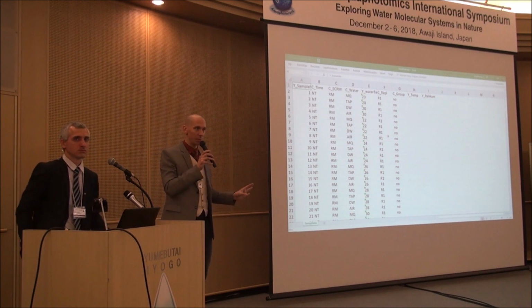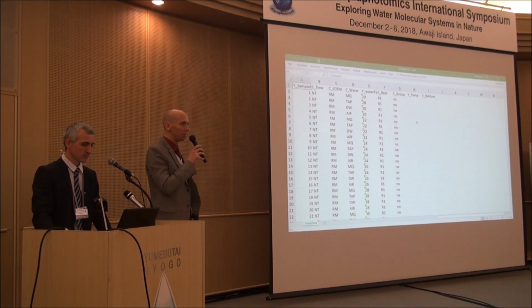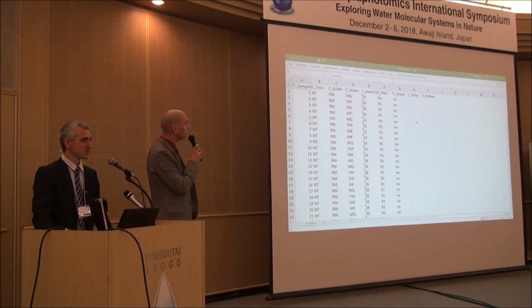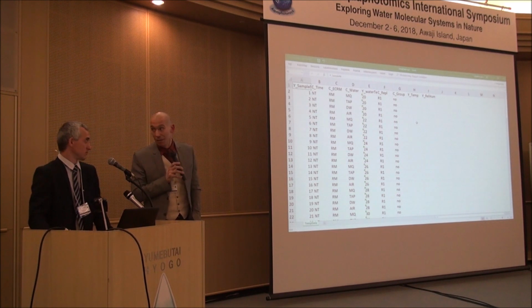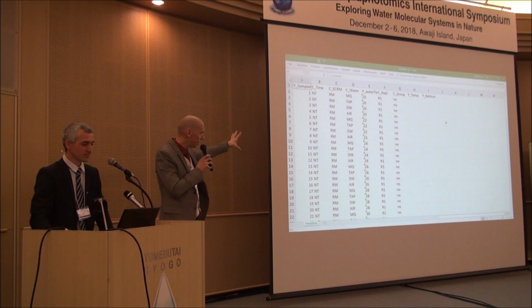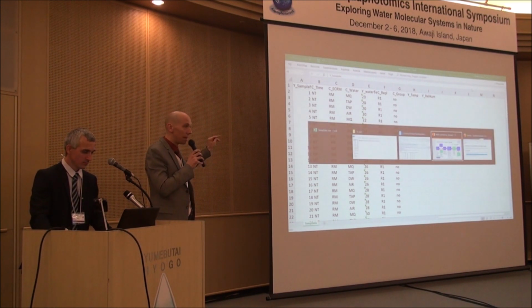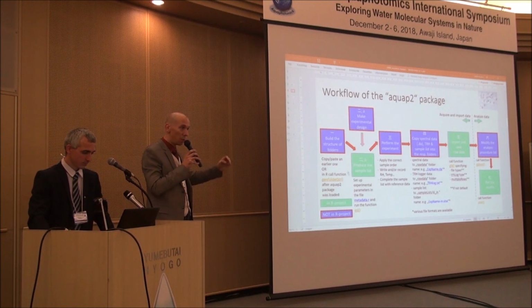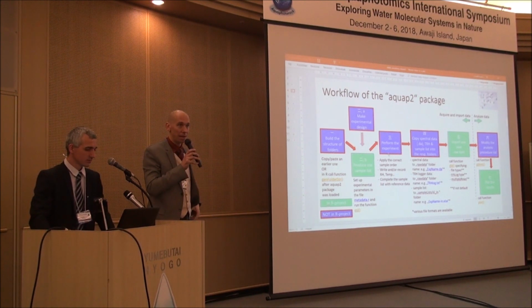According to some rules that you specified, what you will learn when you go into the whole material, the package made a nice sample list for you. You now can take this file on your laptop, go to the lab, make your measurements, and work it one row after the row. It is randomized to try to avoid machine drift or any other complications throughout the day.